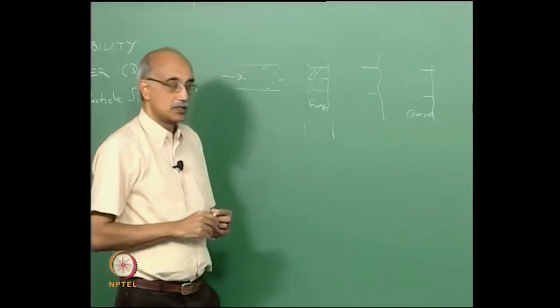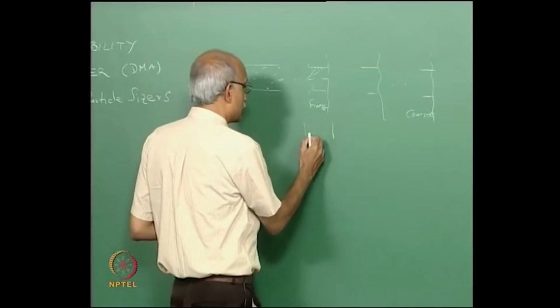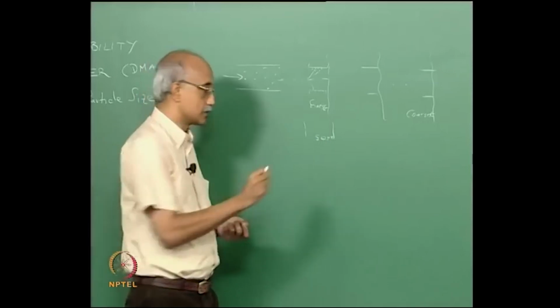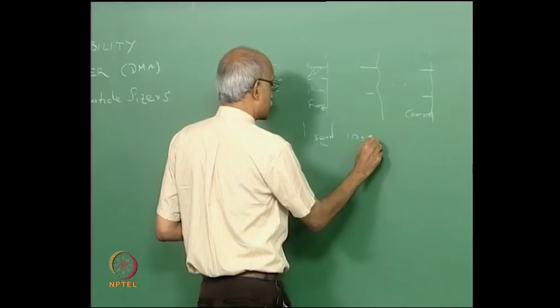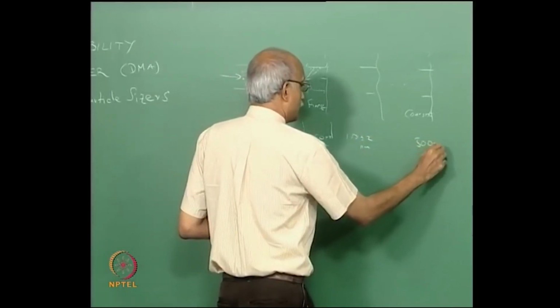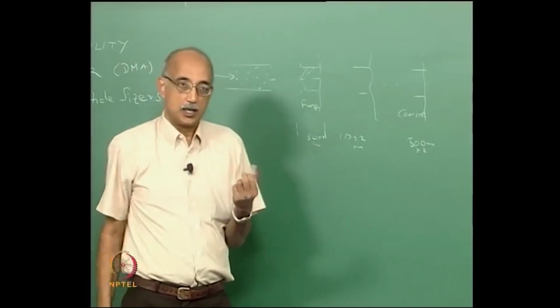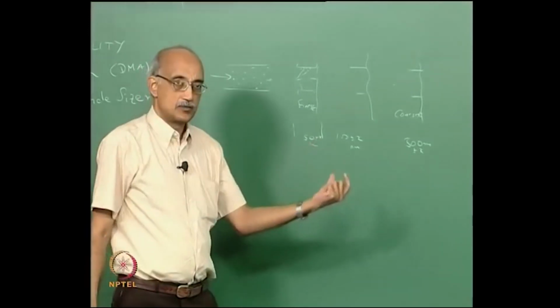Let us say that this population ranges all the way from 50 nanometers to 500 nanometers. These particles are likely to be in the 50 plus or minus some x size range nanometers, whereas the next may be in the 100 plus or minus x nanometer size range, and so on, and the coarsest one will contain 500 nanometers plus or minus x. So, by suitably designing these meshes and the distance of separation between these meshes, you can get as fine a separation as you want.